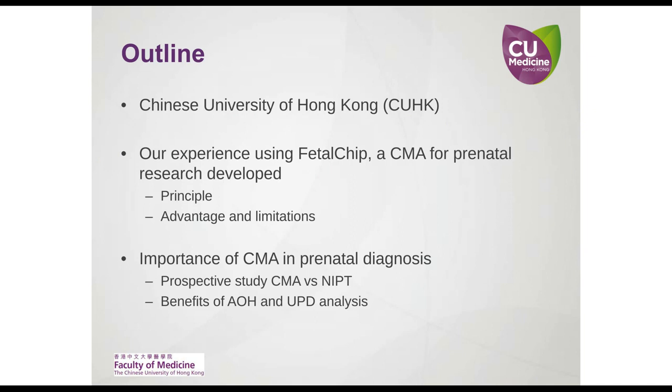And in the last part of my talk, I'm going to share with you some of our research findings regarding how we can make use of chromosomal microarray, and also the benefits of being able to detect AOH as well as UPD using the SNP array.